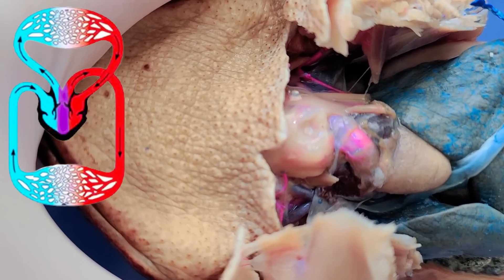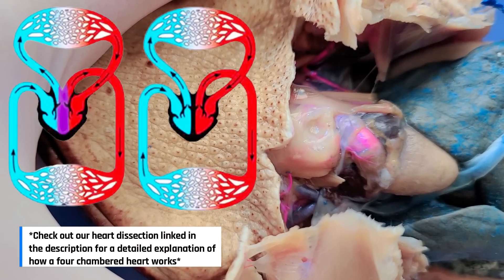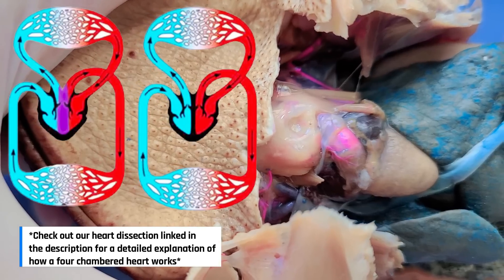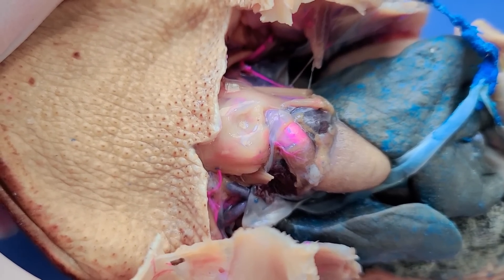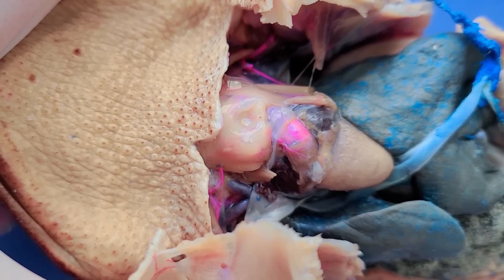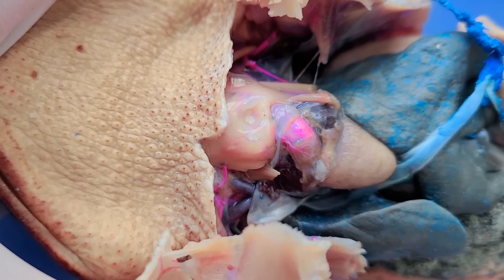In humans and other mammals, the heart has four chambers, which allows for a complete separation of oxygenated and deoxygenated blood. However, in frogs and toads, a three-chambered heart is good enough because they can take in oxygen through the skin, allowing for a less efficient oxygen distribution in the circulatory system.